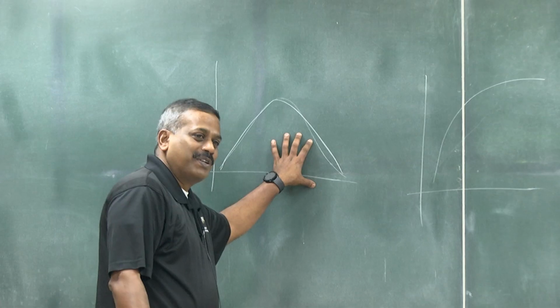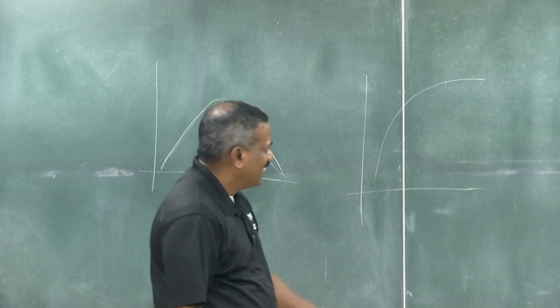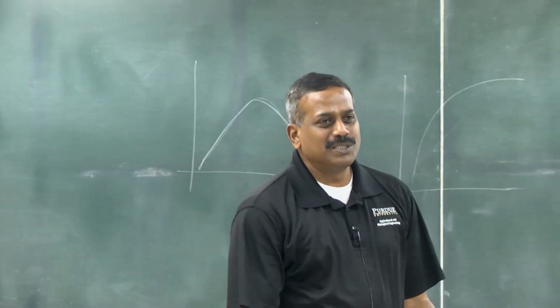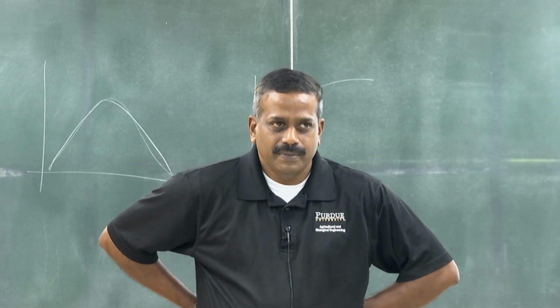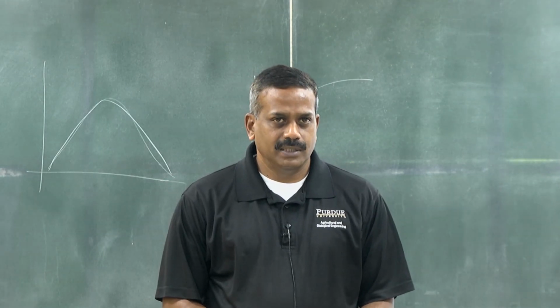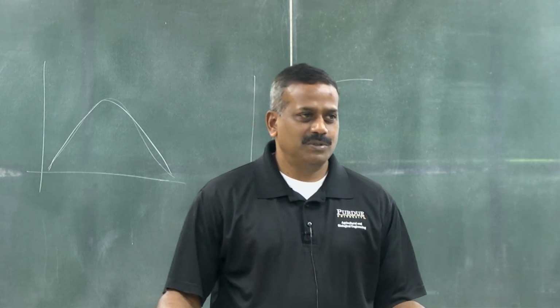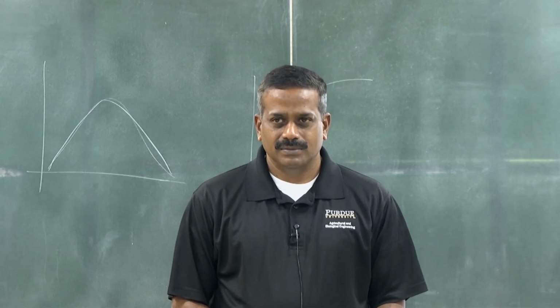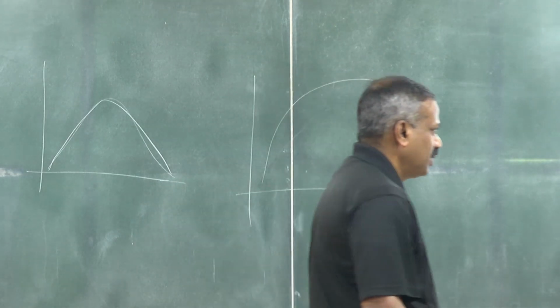Okay, this is frequency distribution, right? You all know, right? What is this called? Cumulative distribution. So these are the two distributions we generally plot, right? Frequency and cumulative distributions. So do you know why we plot these frequency and cumulative distributions? Or what difference does it make? Why do we have to plot frequency or cumulative distributions? Any thoughts? Okay, keep thinking, but we'll go through that in a minute.